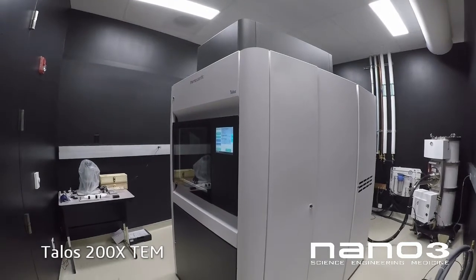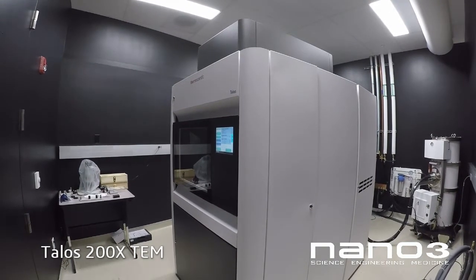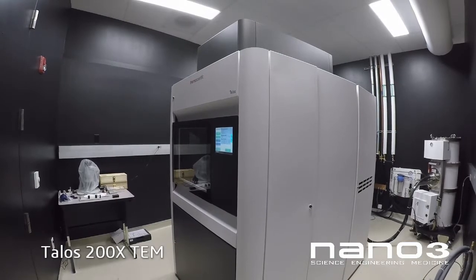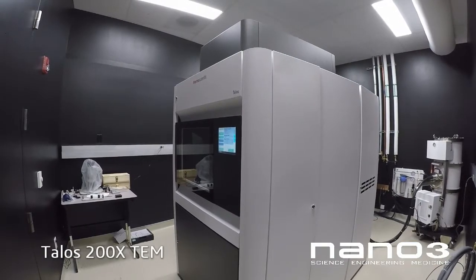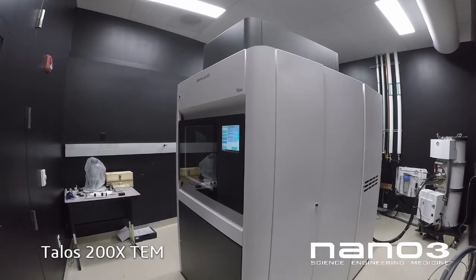This video will introduce you to Nano3's TEM laboratory and give you a primer on what to expect during your first training session.